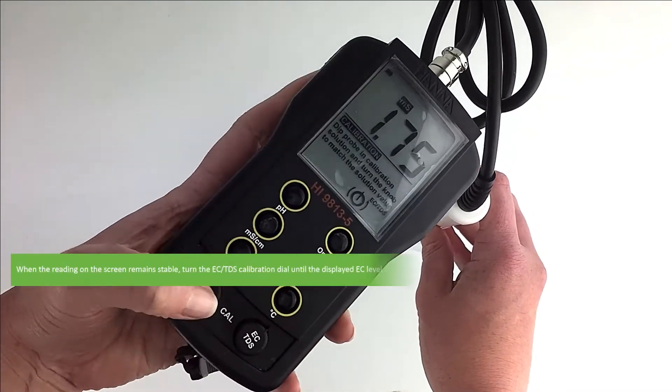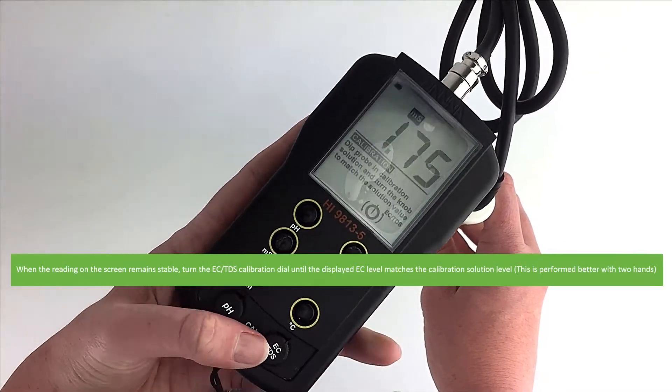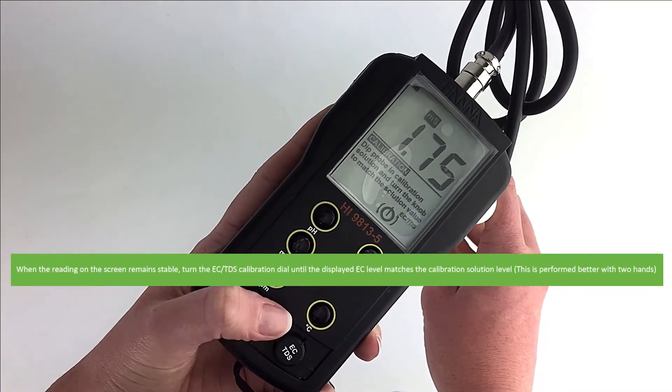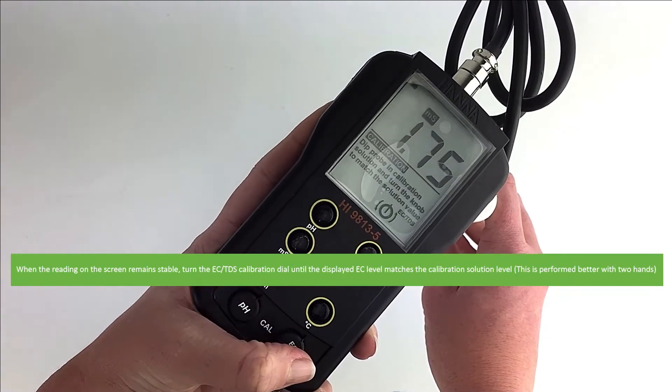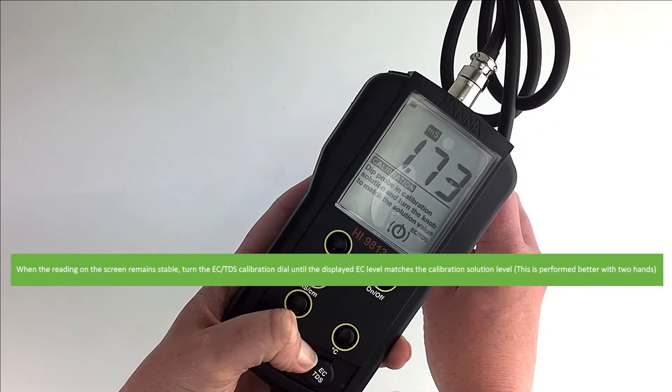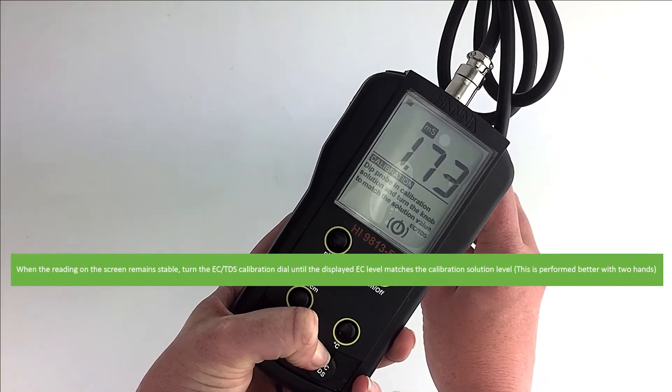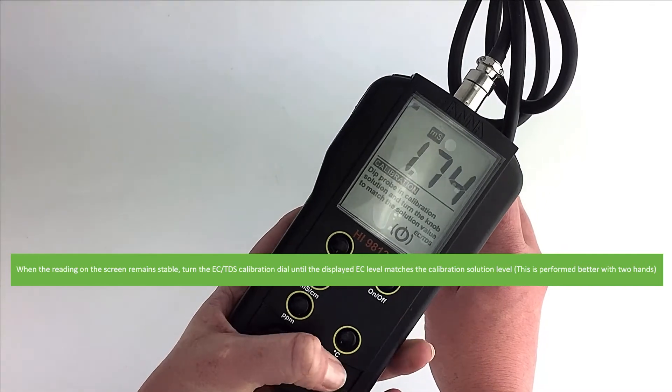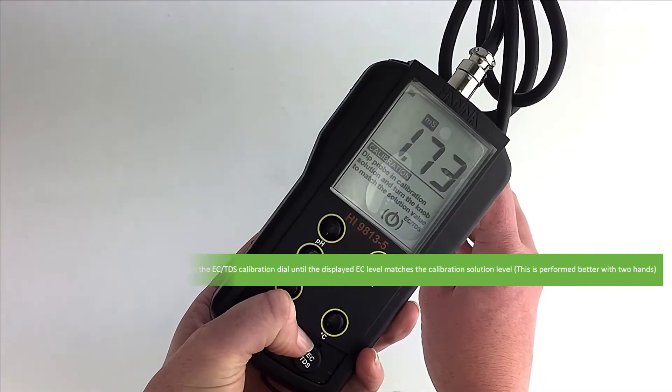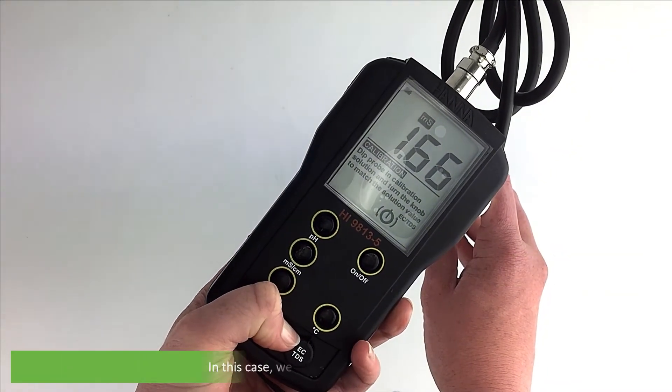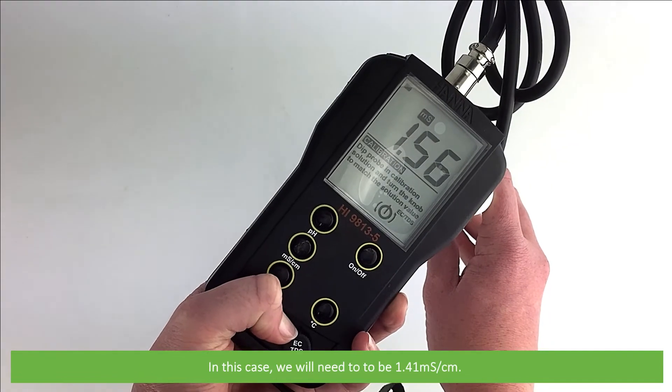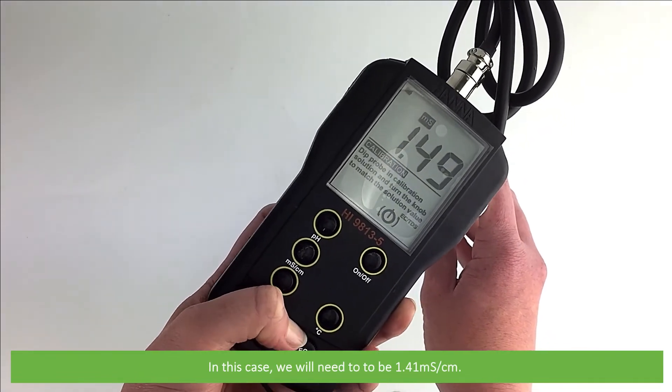When the reading on the screen remains stable, turn the EC TDS calibration dial until the displayed EC level matches the calibration solution level. In this case, we'll need it to be 1.41 millisiemens per centimeter.